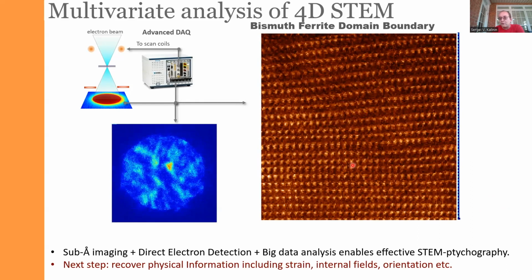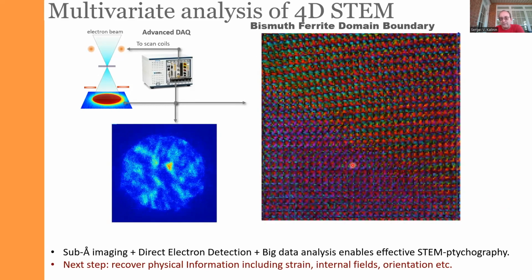But in this case, you lost all the information present in each diffraction pattern. If you apply an analysis such as PCA or NMF, you start to see beautiful clustering. And now you can visualize that there are two different phases here simply based on how the colors appear.